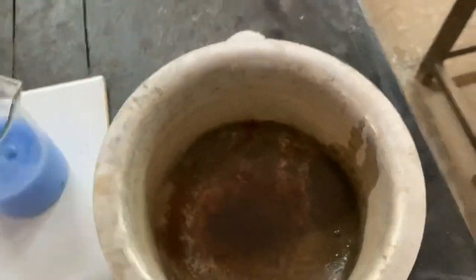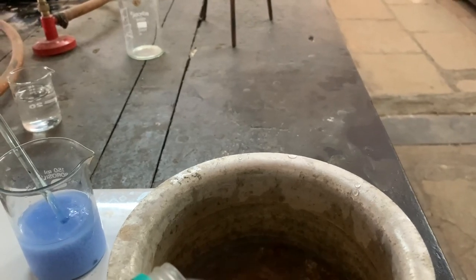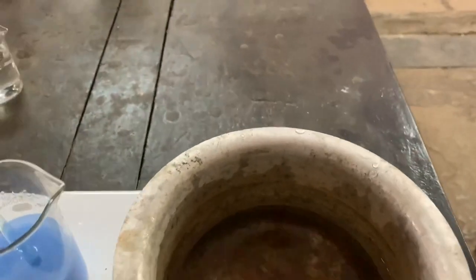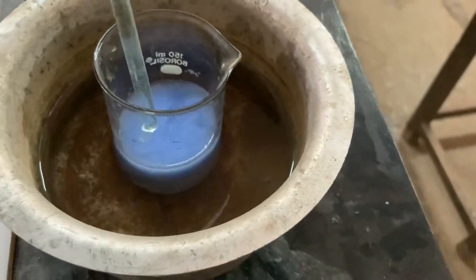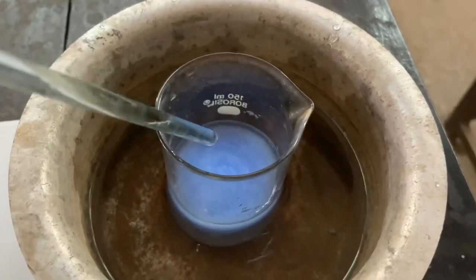This is our water bath here. To it we'll add ice cold water. You can see the turbidity of the water, that shows the water is ice cold. Now to this water bath we'll keep our complex for about 15 minutes so that the crystals are separated very well.